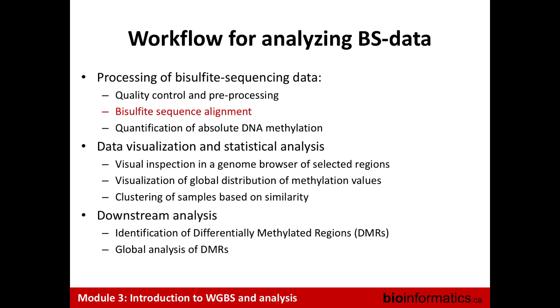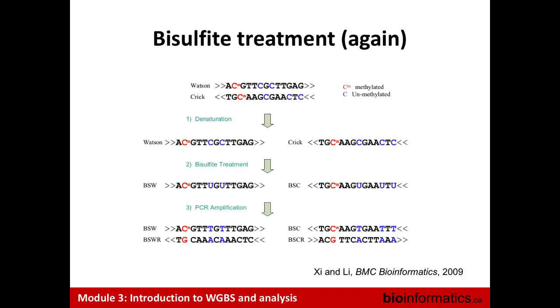At some level, it's true with DNA sequencing reads as well: the reads don't perfectly match the reference all the time. There are SNPs, different things, sometimes repeats. But now, with the bisulfite treatment, all the reads don't match the reference. So it's a free-for-all in terms of what you're getting in the read. It's really not such a trivial problem because you also need a method to find where they go very fast. You've got millions of reads, the reference is gigantic. I'm not the one who wrote that program, but it's not easy.